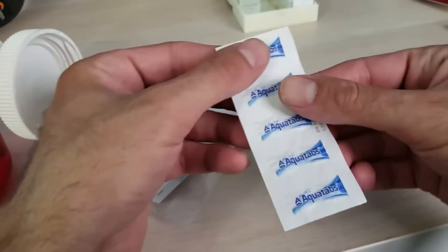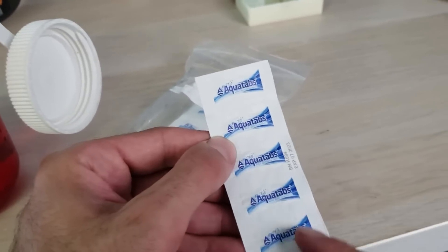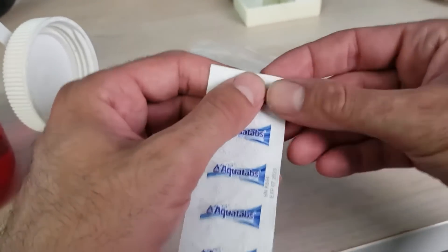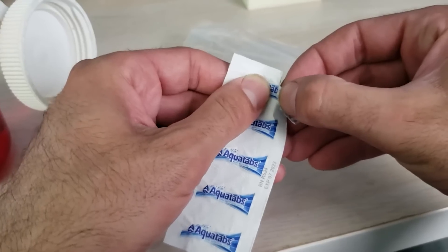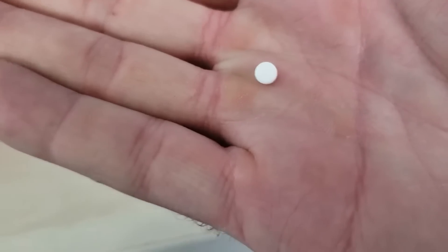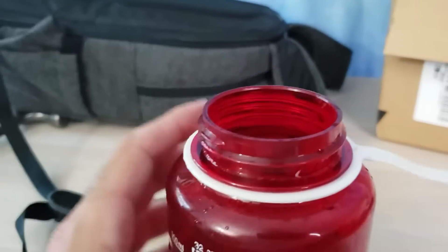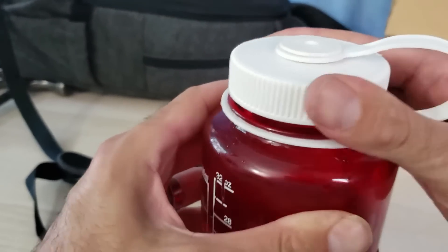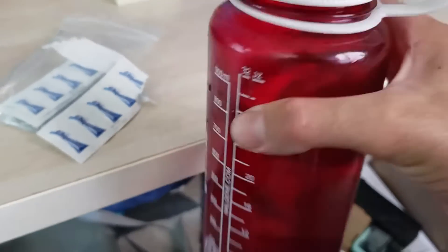All right, so the AquaTabs come in strips like this — five columns of tabs. You just tear it open. This is how tiny the tabs are. We're just going to pop that right in the top, cap it, and we're going to mix this around for 10 minutes and then let it sit for 30 minutes.